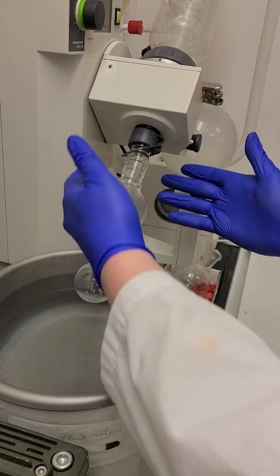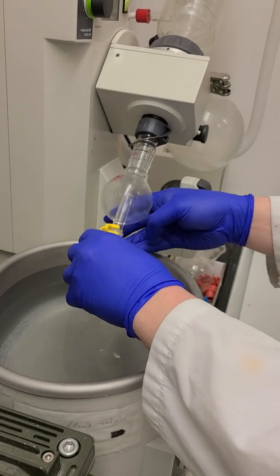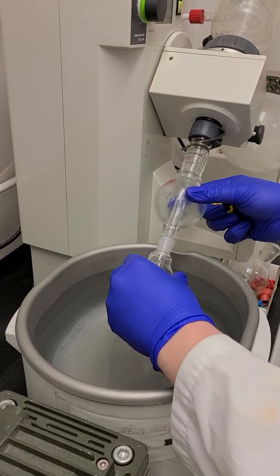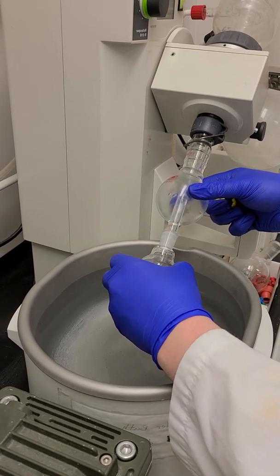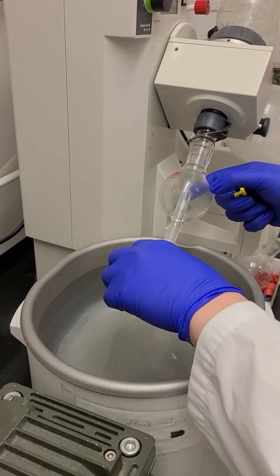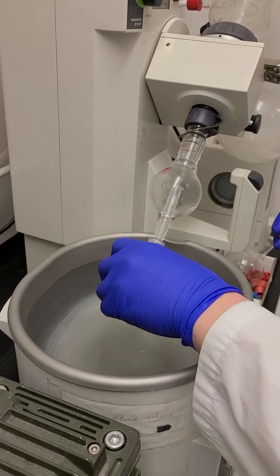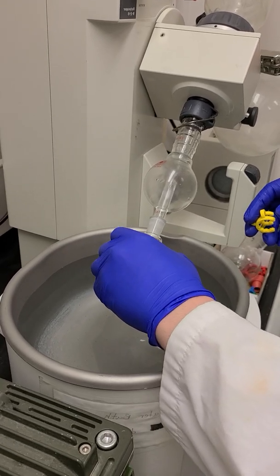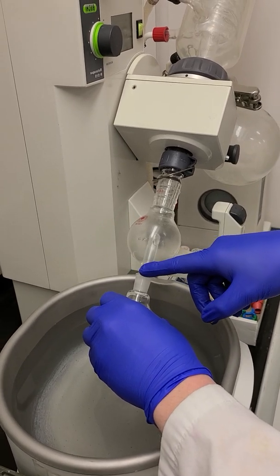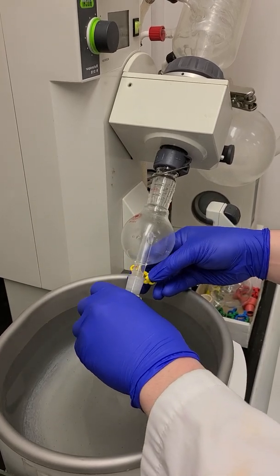This should hold. Try not to twist or bend on taking this off. Upon taking this off, pull it straight out, twist slightly, and pull down straight. What you don't want to do is put any torque onto the glass and break the adapter. If it's fused and really stuck on there, you can squirt a tiny, tiny amount of ethanol in there, twist it a little bit and take it out. It should come off. Let's just keep this on here for now.